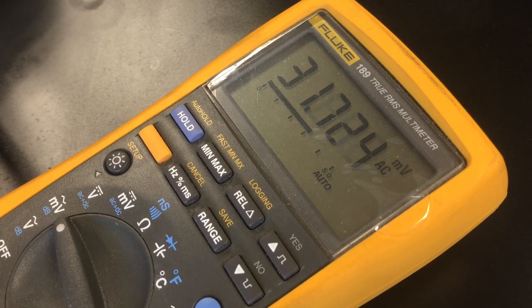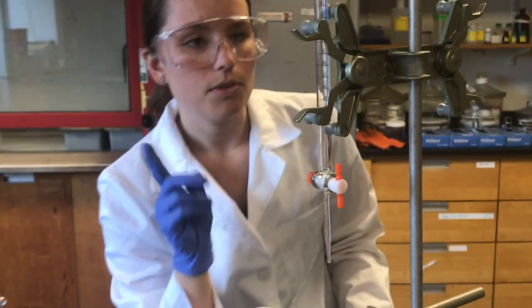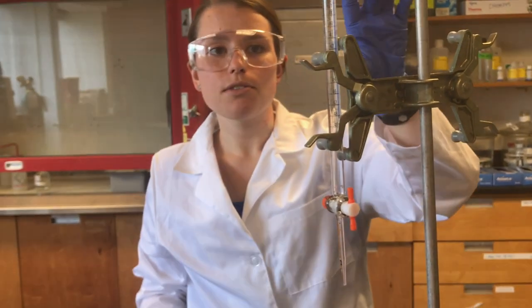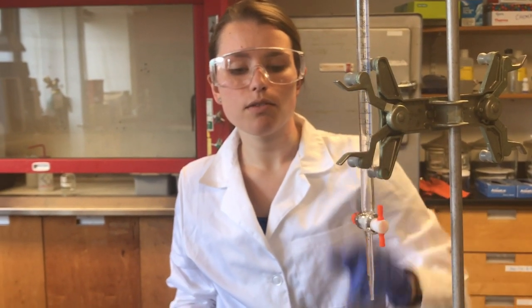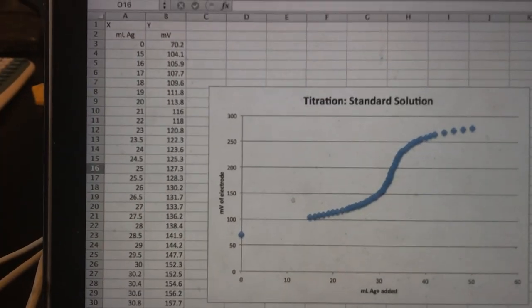This is the initial reading — it's reading the millivolts. Fill the burette with the silver nitrate standard and titrate the first 15 milliliters in to get a reading. Then titrate one milliliter at a time after that to get your titration curve. You should be graphing as you go, just like we did in the last lab.